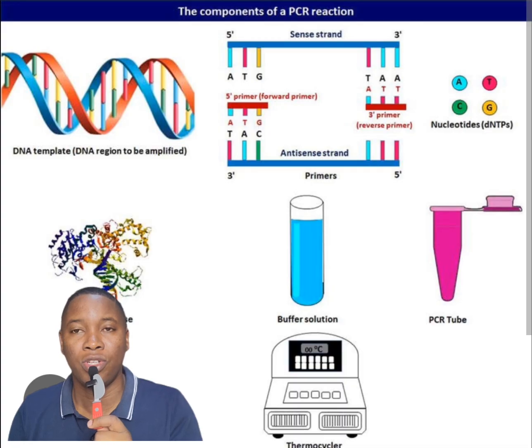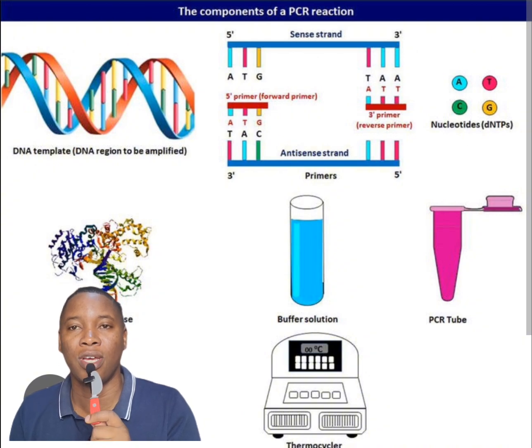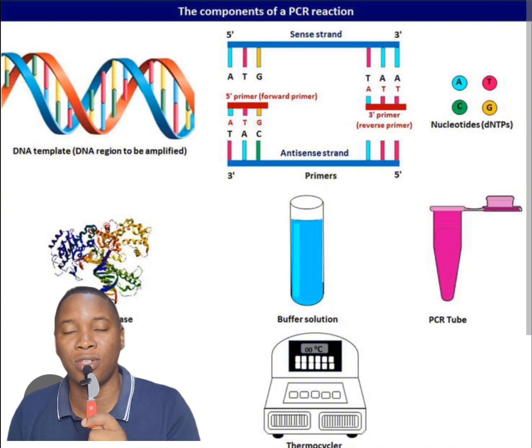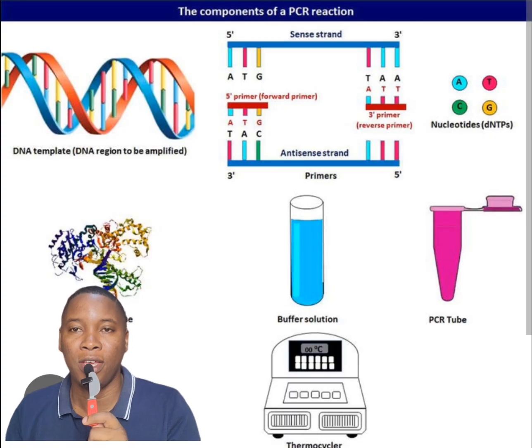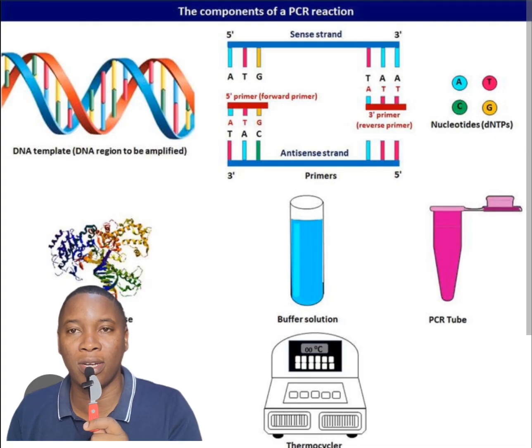When you first do your denaturing, where you divide your double-stranded structure into single-stranded structures, you then add your primers, and that is the process we refer to as annealing. In annealing, your primers are able to target particular points along the length of your DNA, because they mimic what you have on the DNA.